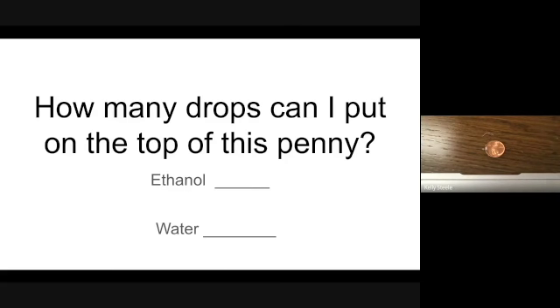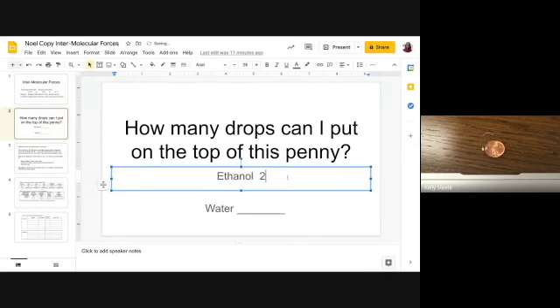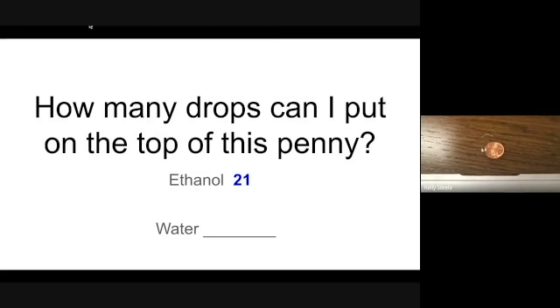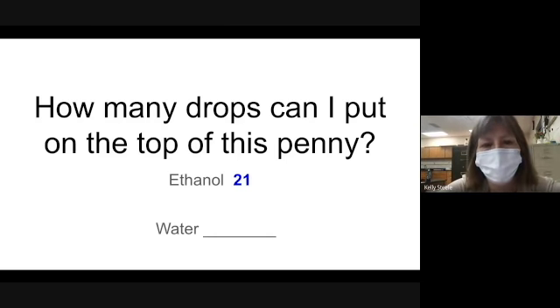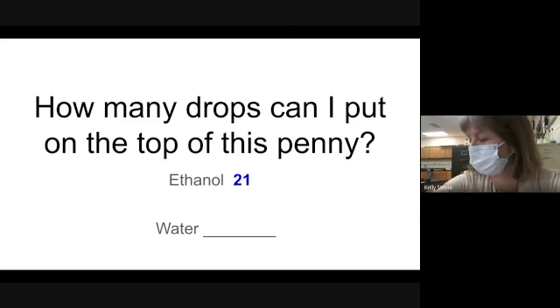I got to 21. Jordan, what did you get? And you're using the ethanol, right? The one where you got not much in it? And Jalen got 14. Jordan got 31. You must be really carefully dropping them on there.